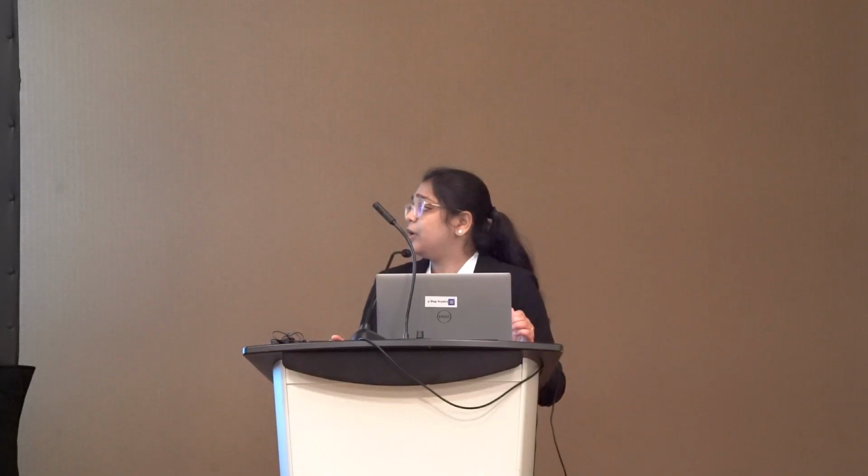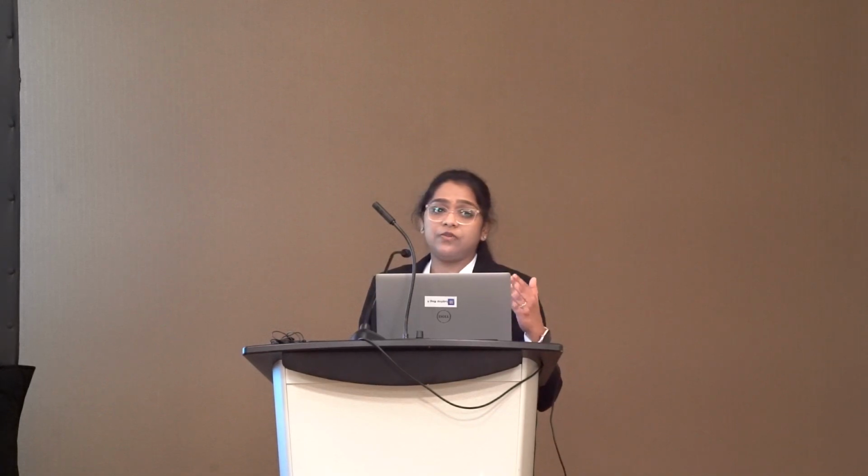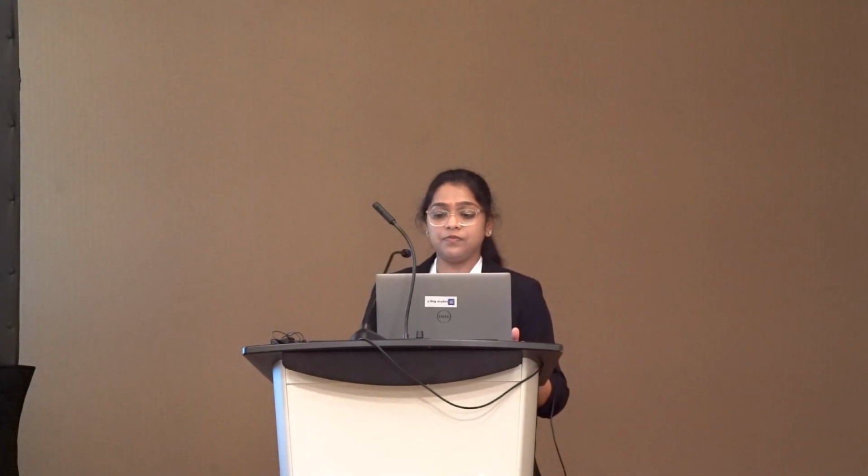And in the volcano plot we can see the upregulated genes, downregulated genes, and non-significant genes, and these are the topmost regulated genes which can be targets for the functional and pathway analysis.